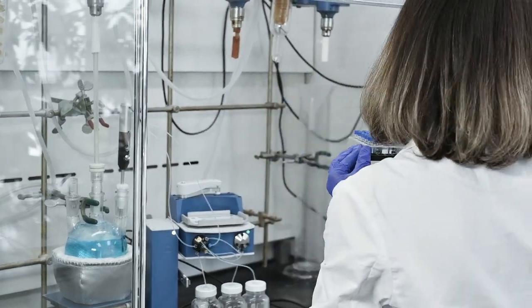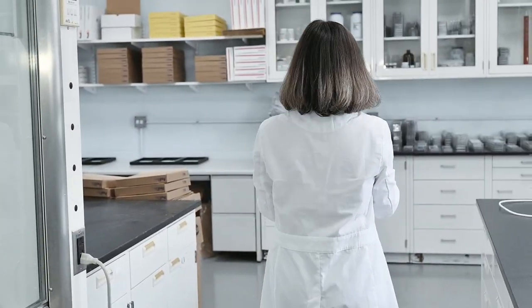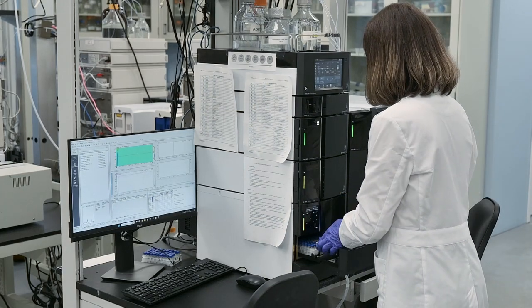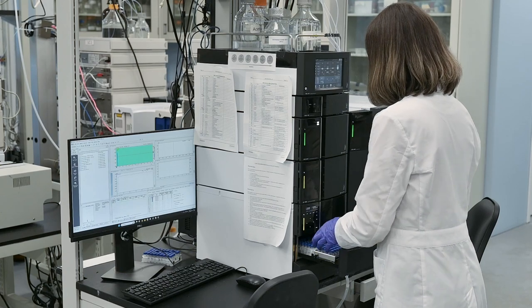Samples are collected in standard HPLC GC vials or 96 well plates and can be analyzed directly by a chromatographic technique without transfer of vials content or sample preparation.